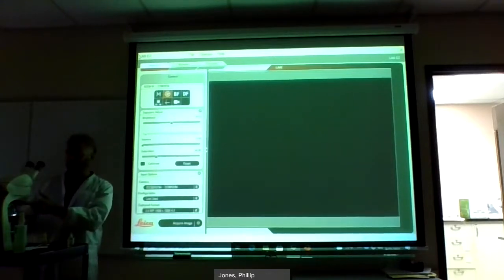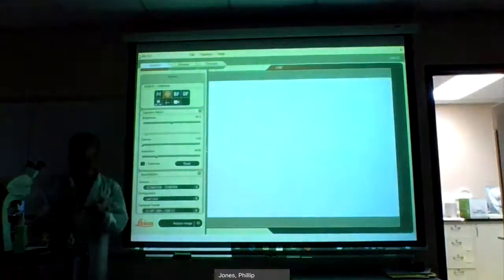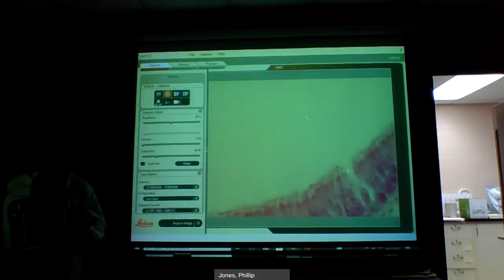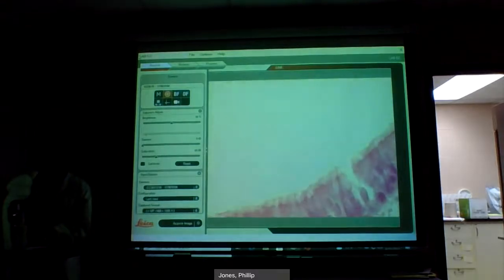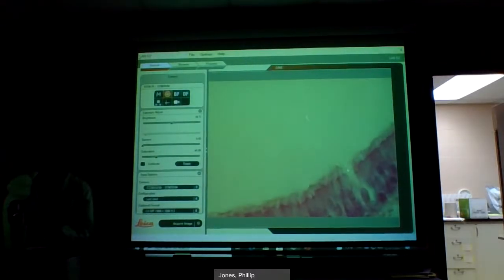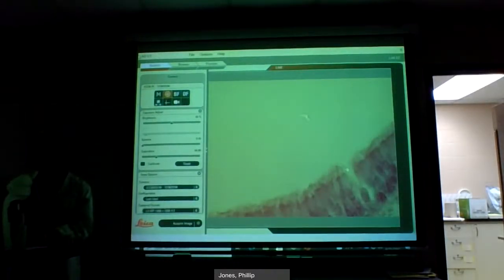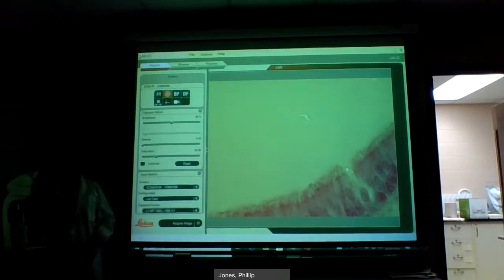Now I'm going to take the lens and lock it right in there. So now I have the light going through the cover slip, then the oil immersion lens. From my view here, it's relatively clear. We can see the structures there. I'm going to hit the lights and turn off the video. If you want to come and look at this, you can.